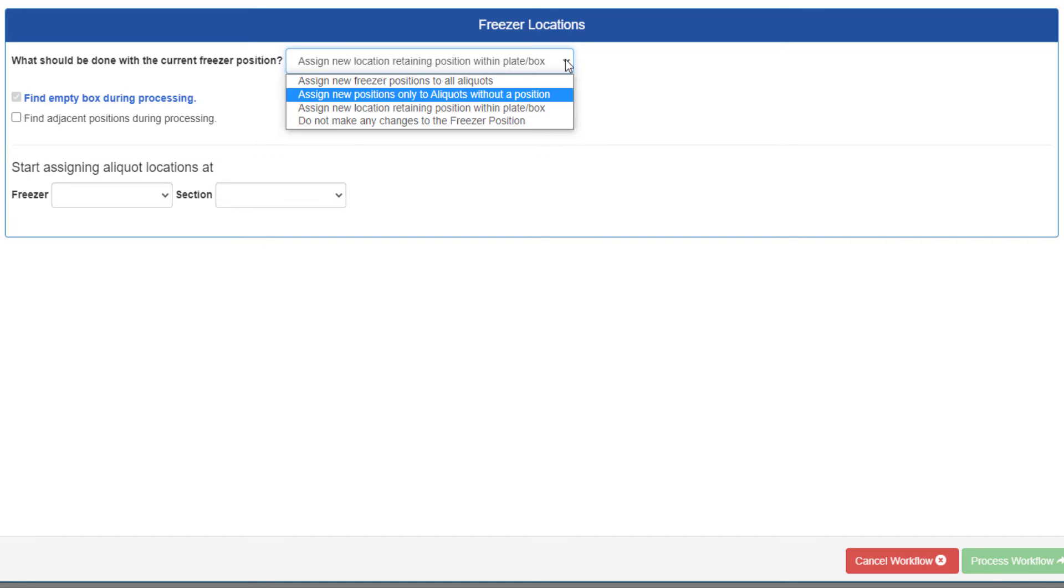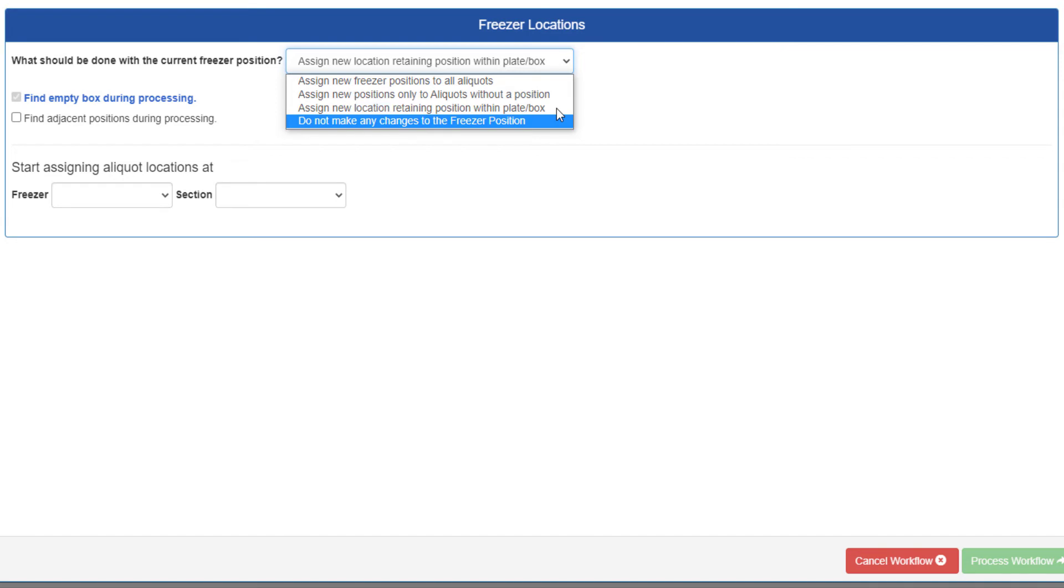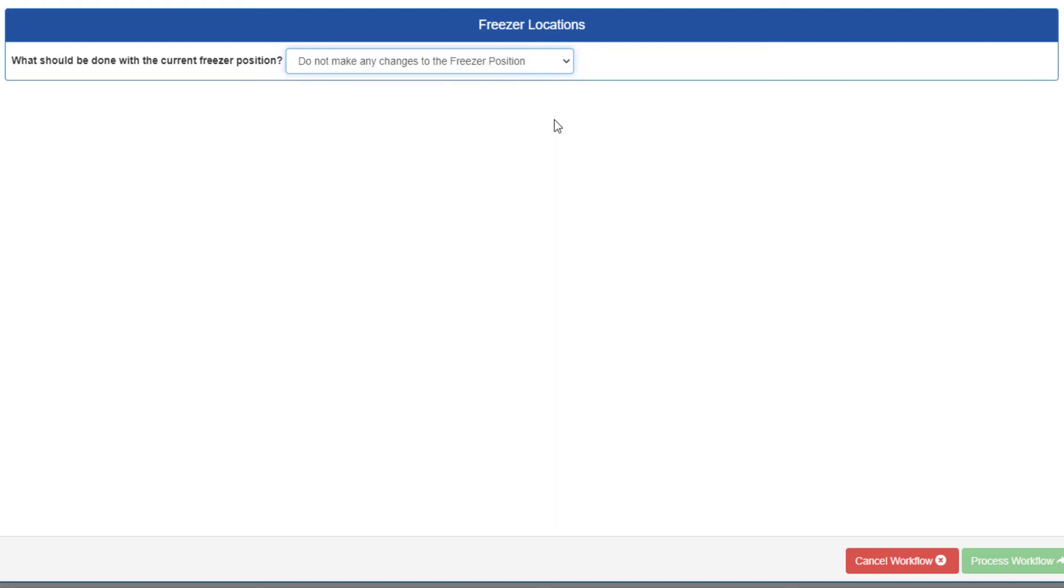Assign new location retaining position within plate slash box, which you should select if you are checking in aliquots that were checked out using the option remove from freezer, but retain aliquot position. And do not make any changes to the freezer position. This last option will cause the freezer assignment fields to disappear, as they're no longer necessary.